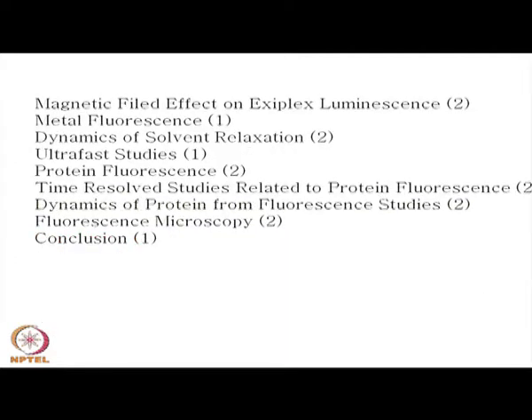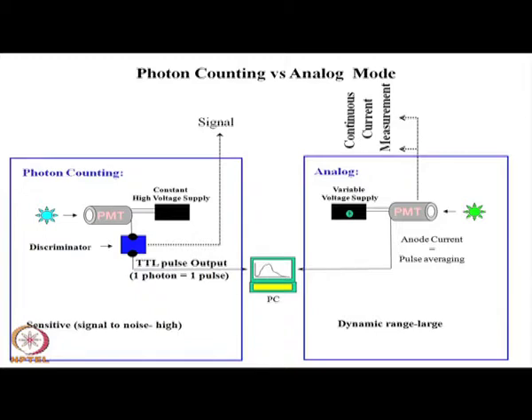Now, the basic design is like you have got a PMT. Here on the left hand side it is the photon counting, or the digital mode, and here it is the analog mode.